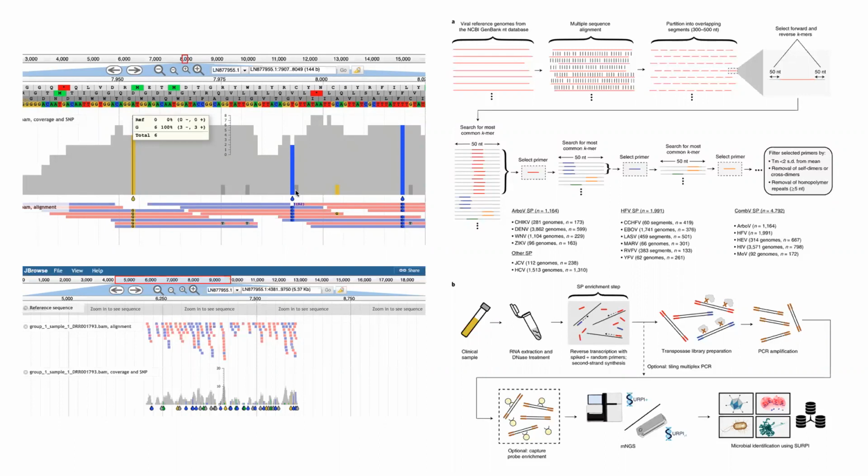So we took one of the samples. In fact, we looked at a sample that has reads in it, so it's the FASTQ file. And we talked about how we can map those reads to understand what's inside, and potentially by looking at differences from the reference genome, identify whether this specific collection of reads represents something that is similar or not similar to the reference genome, and how we were looking for these variants in the reads that we have in the data.